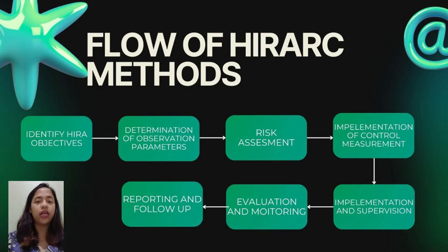And next is evaluation and monitoring. This stage will be carried out after the implementation and supervision step, and can be done when the water sampling activities carried out by students have been completed. This stage will also be carried out by students, staff, and laboratory assistant by monitoring every water sampling activity. And the last is reporting.